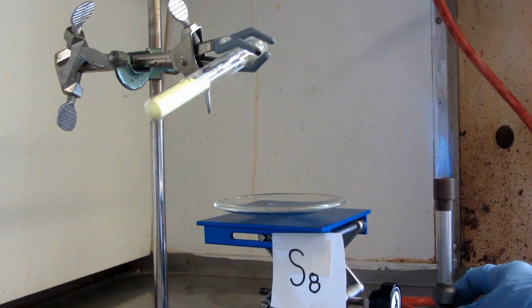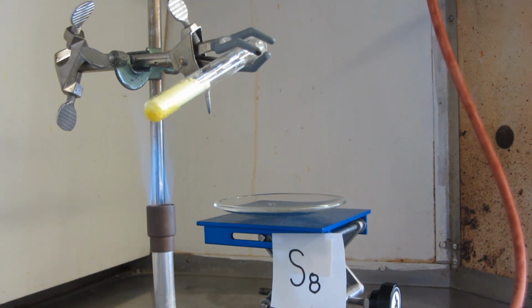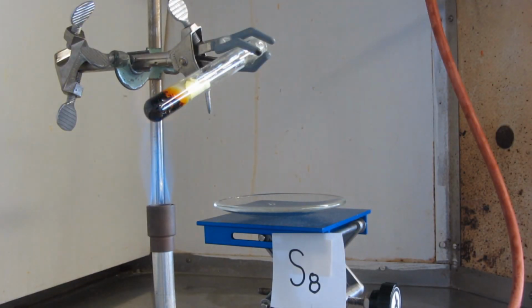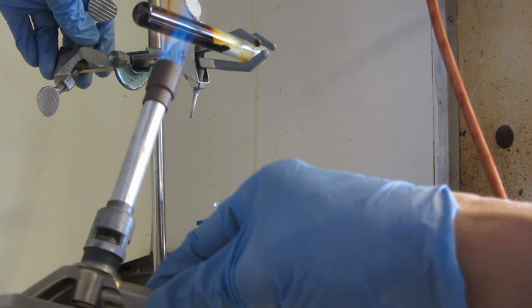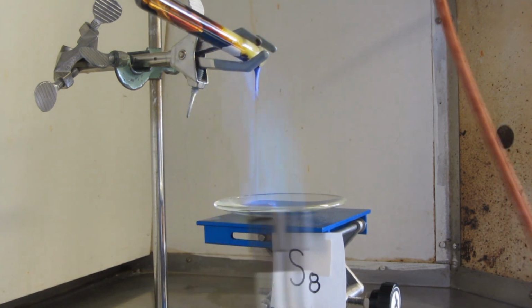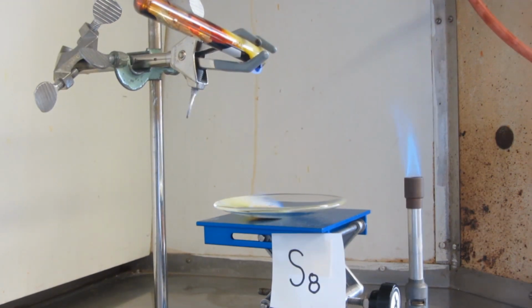Let's take a look at this reaction. When yellow sulfur is melted in a Bunsen burner flame, it forms a dark orange viscous liquid. On continued heating, the viscosity reduces and the liquid becomes thin and can be poured. When ignited, sulfur burns with a bright blue flame, producing a mixture of nonmetal oxides, sulfur dioxide and sulfur trioxide.